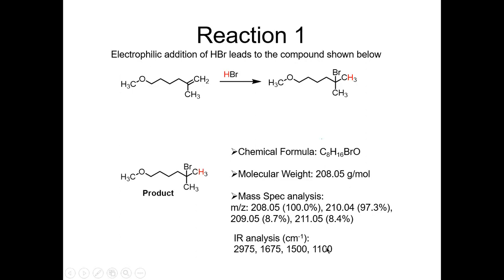What do you think that 1100 corresponds to in the infrared? Which bond in here is that indicative of? It's the C-O single bond. So this bond right here, it's a really sharp stretch at 1100. What do you think 2975 is?